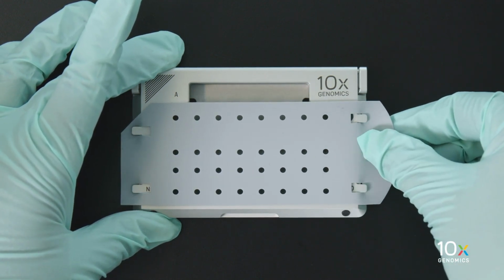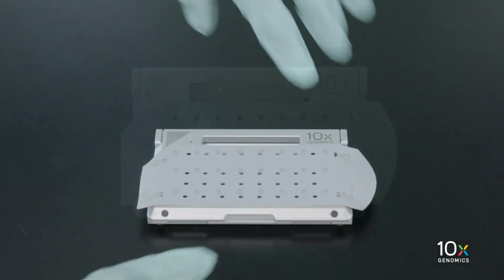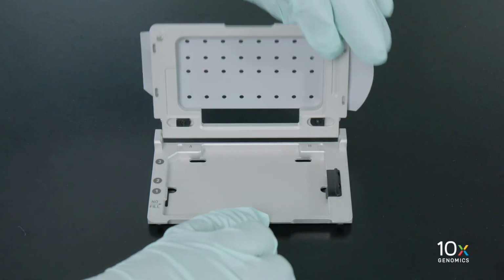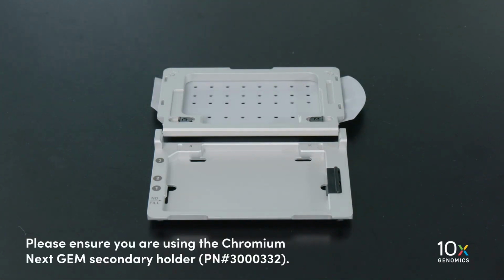Do not touch the smooth side of the gasket. Do not press down on top of the gasket after attachment. Open the Chromium NextGem secondary holder with the gasket attached. Please ensure that you are using the Chromium NextGem secondary holder.